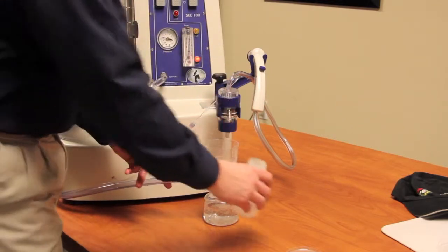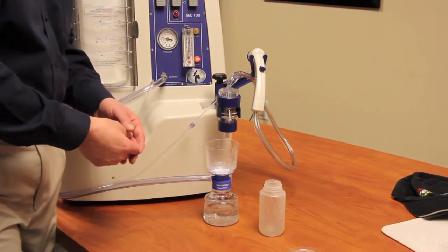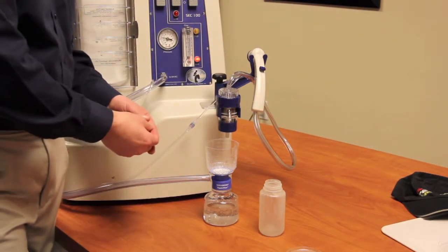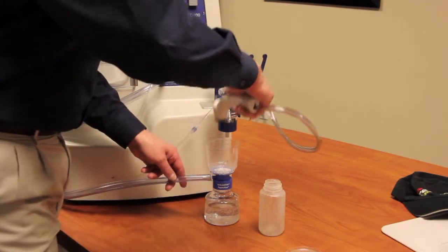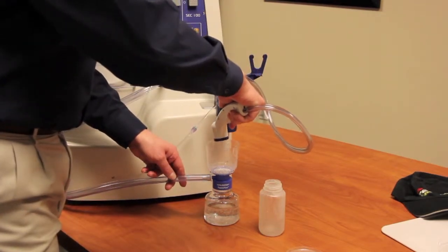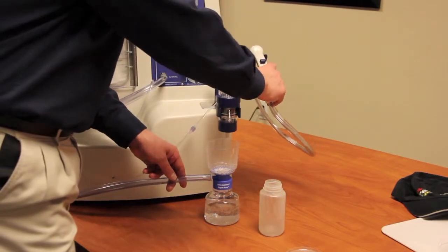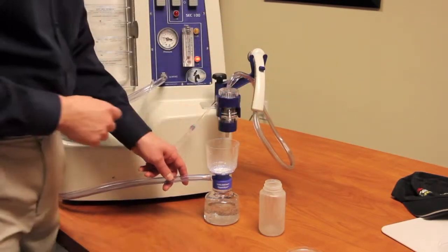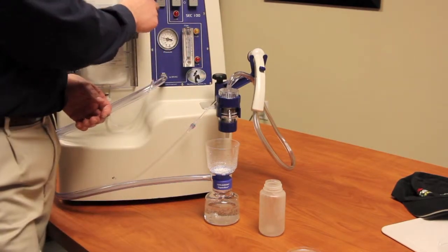And if as you were pouring, it poured rather quickly, and it took a little bit of time to filter through, you can take the sampling head and just spray the sides of the cup so that it washes down any DNA material that may be up there. But other than that, we're ready. So you turn the vacuum off.